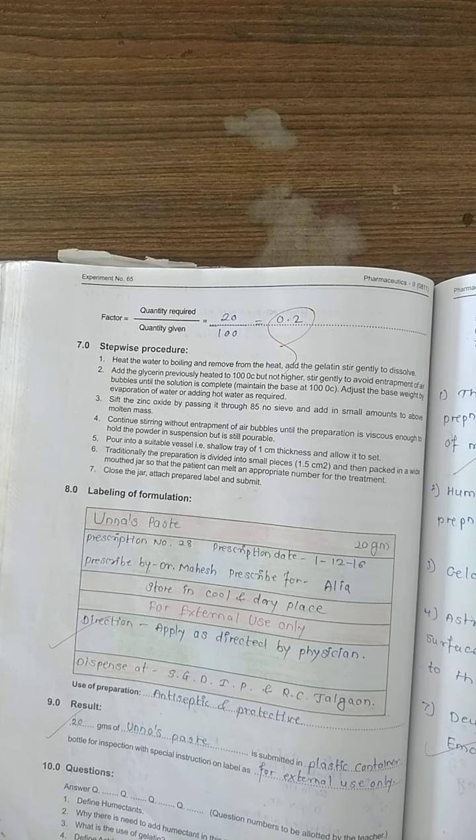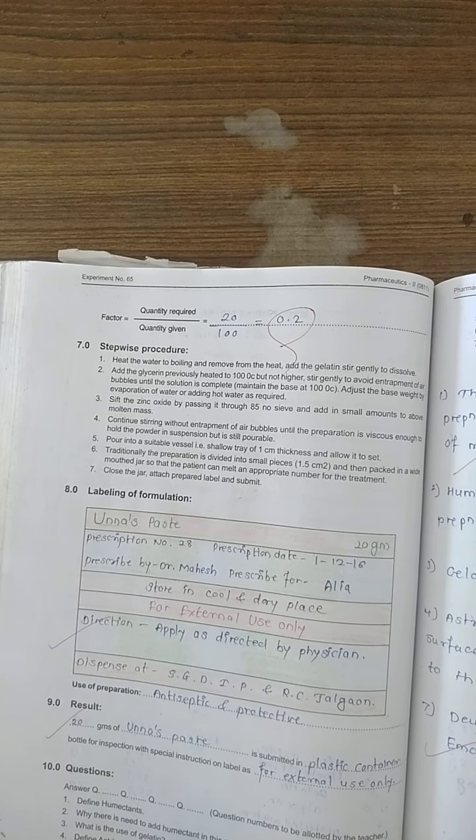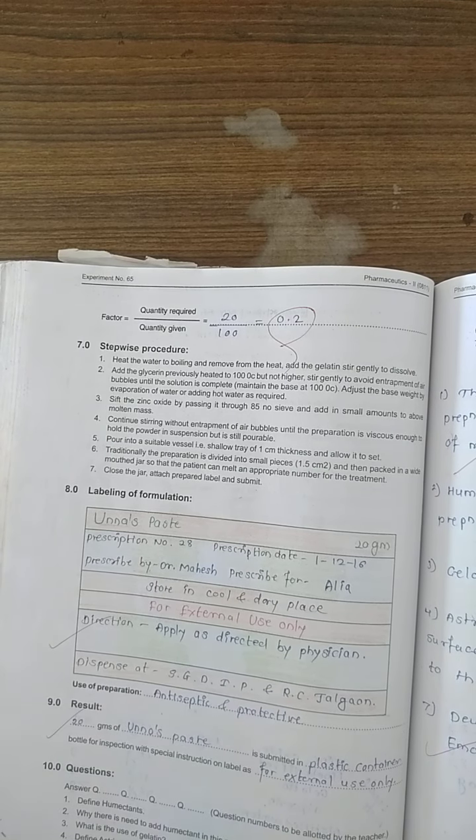Label the preparation. Uses: as antiseptic and protective, and to treat eczema and other skin disorders. Result: 20 grams of Unna's paste is submitted in a plastic container wide-mouthed bottle for inspection with special instruction on label for external use only. Experiment number 65 ends here.